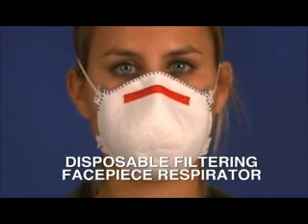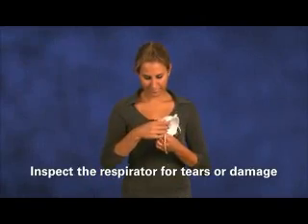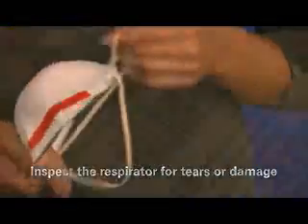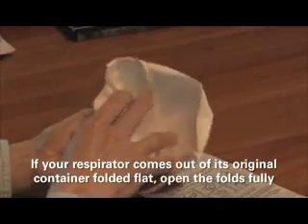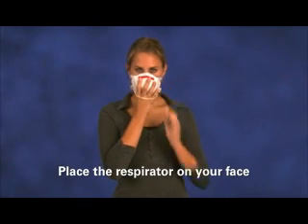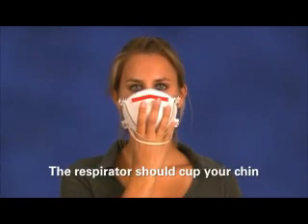Let's begin with general instructions for a disposable filtering facepiece respirator, which is often referred to as an N95 or a dust mask. Inspect the respirator, including the straps, for tears or damage. If you find any damage to the respirator, replace it. If your respirator comes out of its original container folded flat, open the folds fully, following the manufacturer's instructions. Using one hand, place the respirator on your face with the nose piece at your fingertips, allowing the headbands to hang freely.